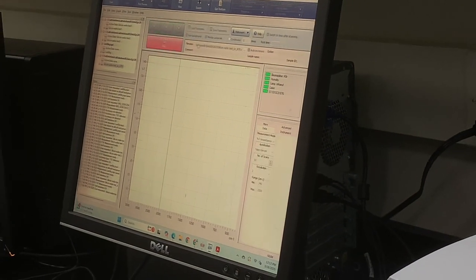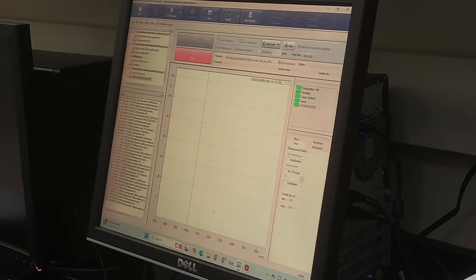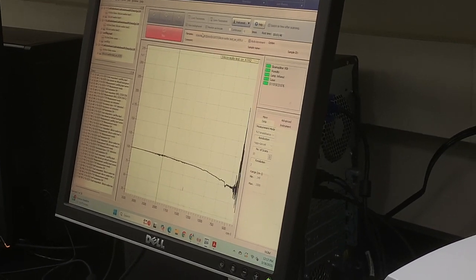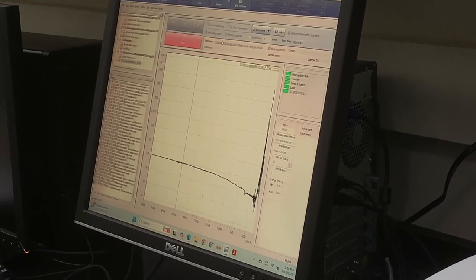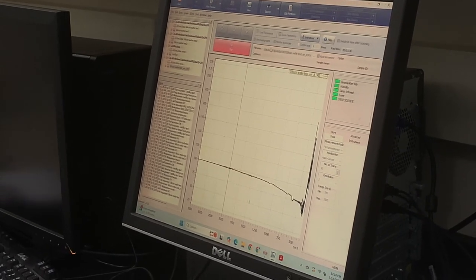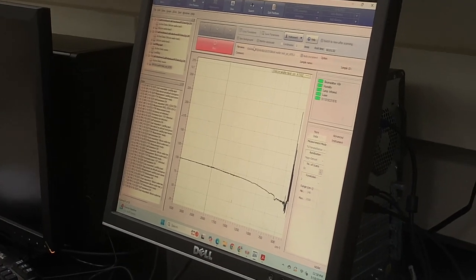So this would be a good experiment for you to see with your hand tightening versus all the way. Actually, I was afraid to push. Don't be afraid about it. I know the feeling. That's how we do diamond crystals. But the germanium crystal, that one's soft. I would be worried if you had the germanium crystal, but with the diamond, it's fine.